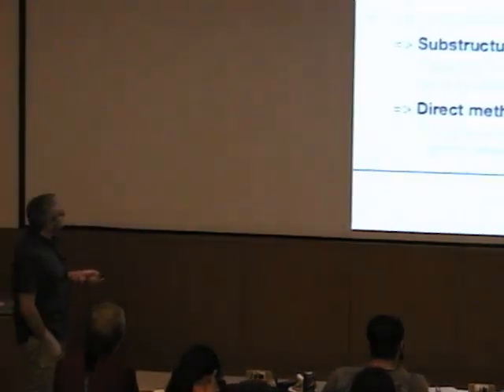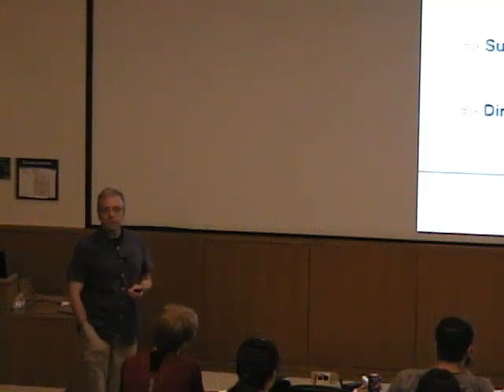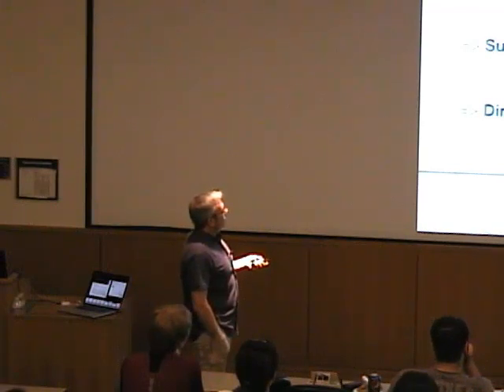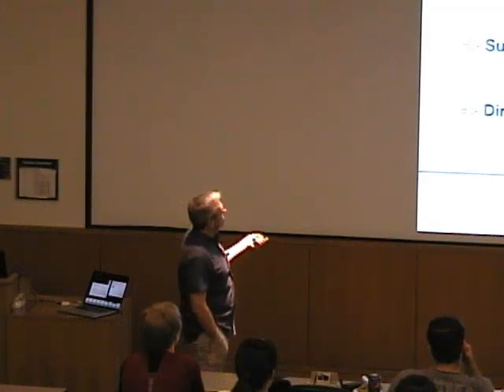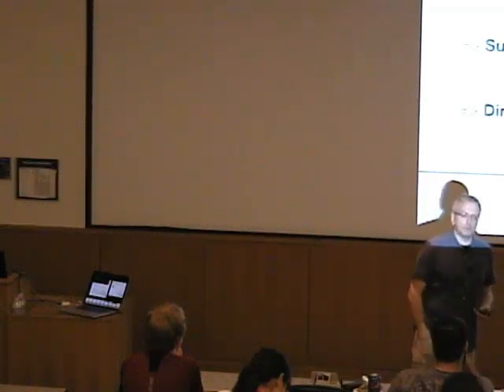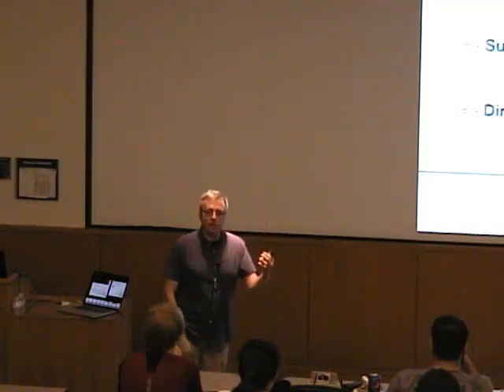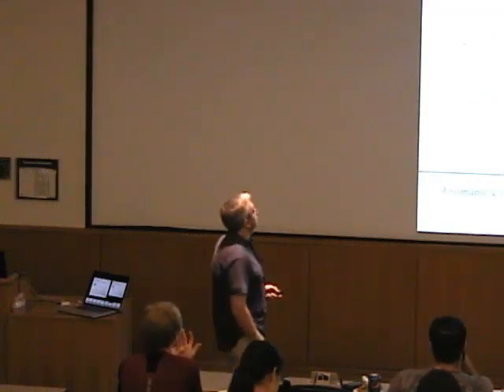Okay? And the better way, of course, is to say you do a de novo structure solution. And that you can either do by direct methods. This is what Karle and Hauptmann invented. And this is actually what, with a little trick, we are doing in the practicals. Well, actually, no. It's just what we use as a tool to go to the other point, which is called substructure analysis. So if your problem is too big to solve it, you need to find a way to go and make your problem smaller. It's that easy. And that means we start out by looking only at a subset of our structure that is so simple that we can solve it, and then take that information to go back to our real structure.